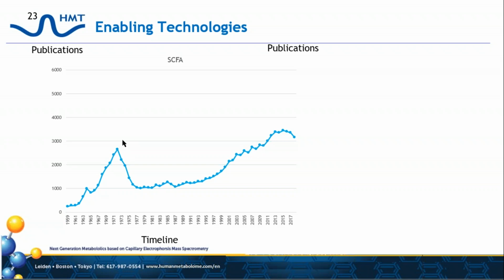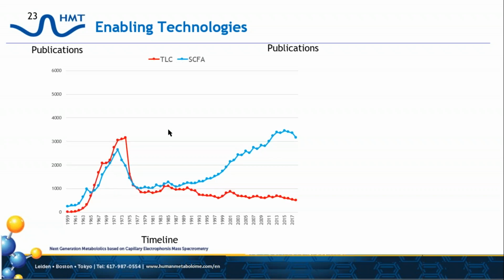You can see here in the early 70s there's a large bump, which is kind of unusual when you look at these types of publication histories from PubMed. We found this is actually associated with thin layer chromatography, if you search that. During this time, the commercialization of these plates became very popular, a popular way to use the silicate to separate out these fatty acids and use chemical ionization mass spec to identify them. So there's a large boost here in these publications.